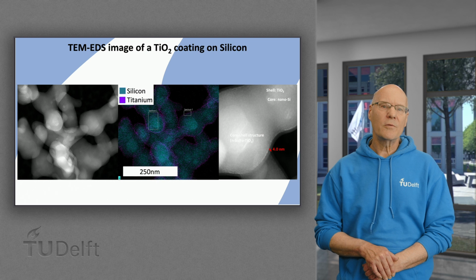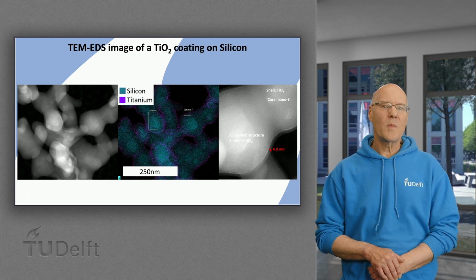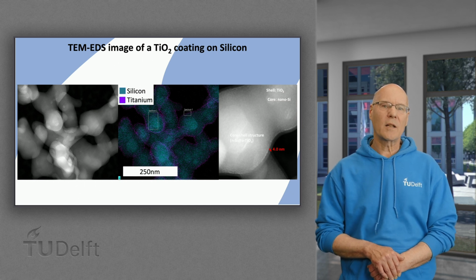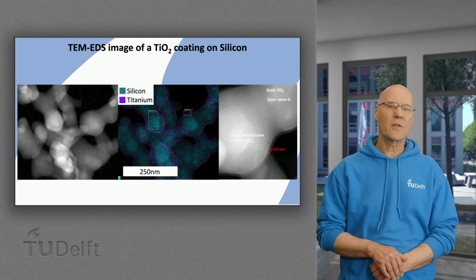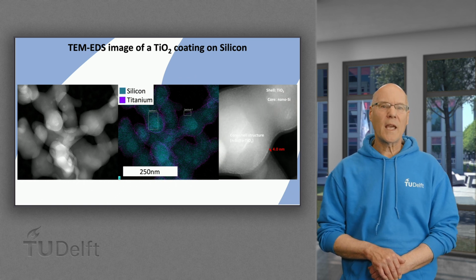It is important to realize that this radiation is element specific. This means that a recorded X-ray spectrum is a fingerprint of the elements present in the sample. Even the intensities of the X-rays give an indication of the concentrations of the elements present in the sample. This typically happens in the subsurface area.